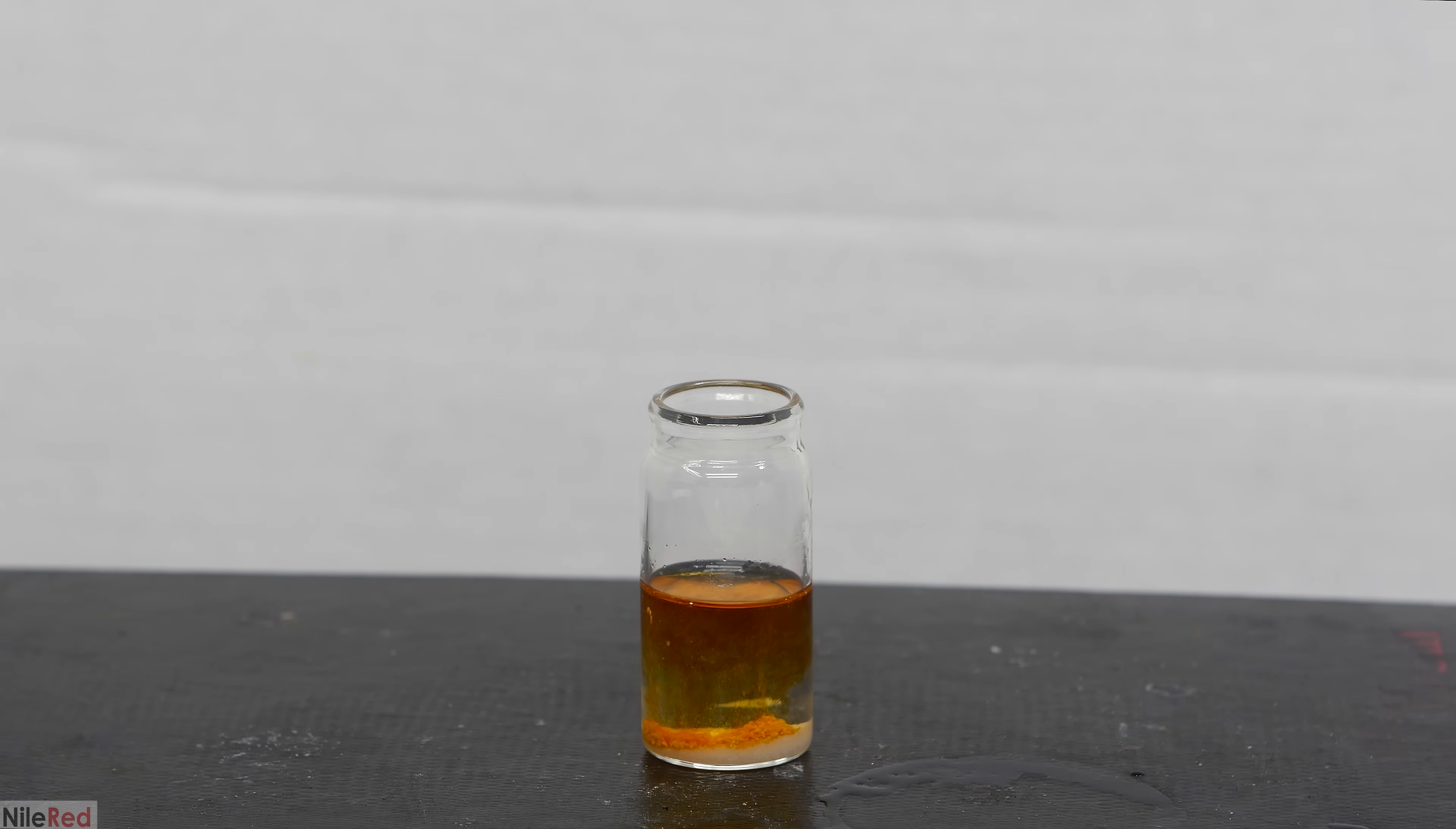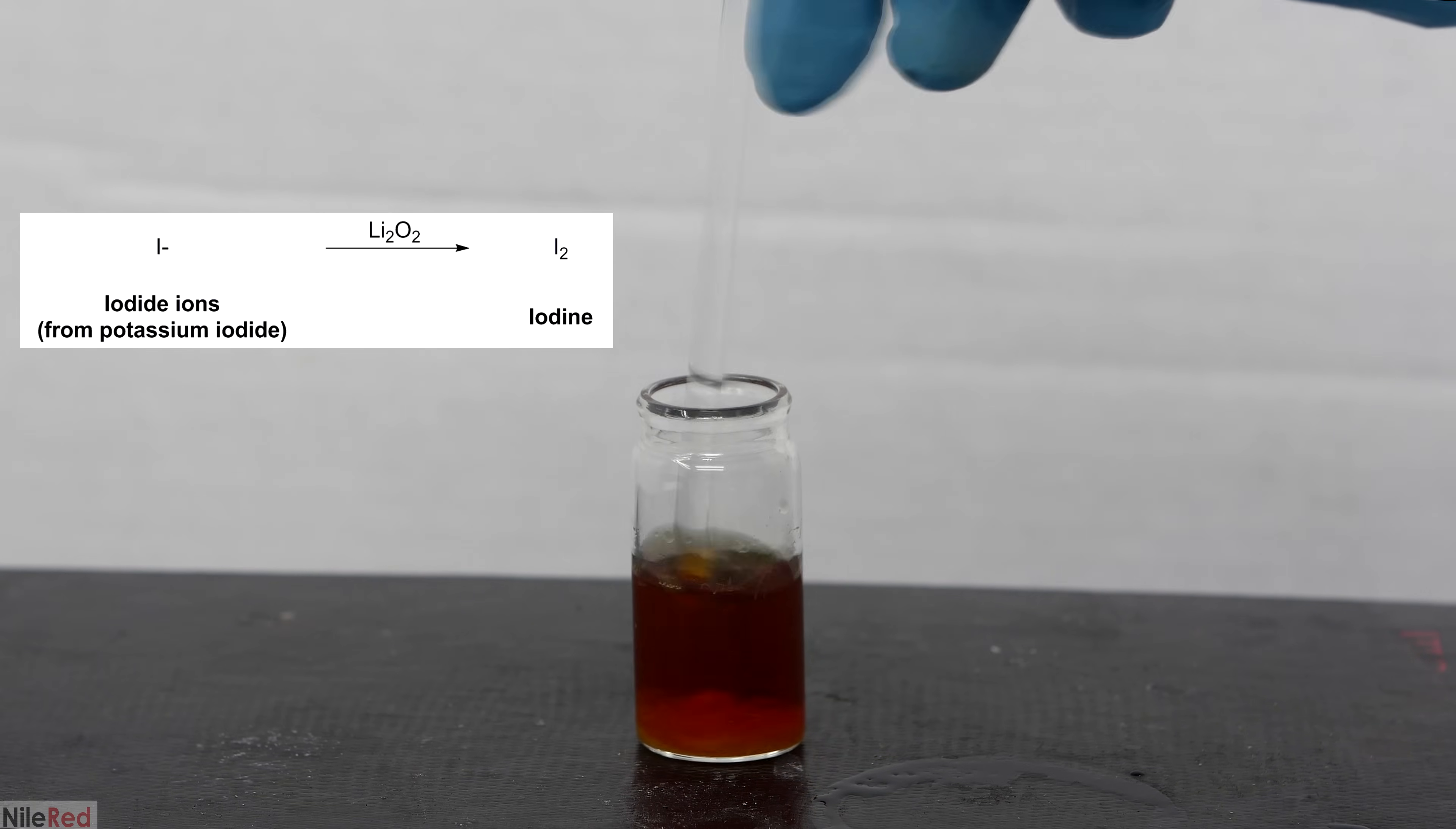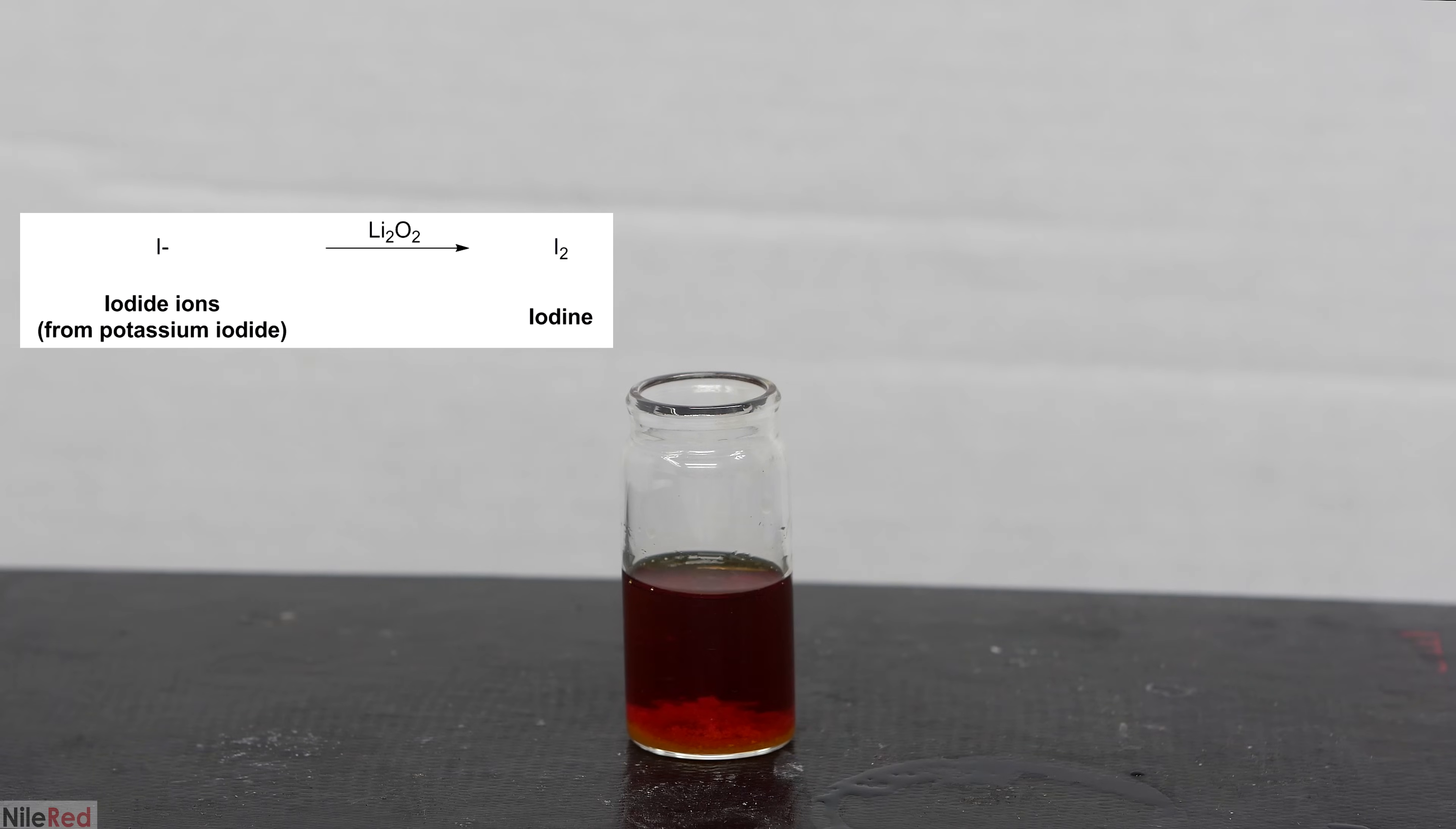When a small amount of the lithium peroxide is dumped in, you can see that immediately it starts to take on an orangey-yellow color. This color change occurs because the peroxide is a strong oxidizer, and it oxidizes the colorless I- ions to colored I2. With this positive result, we can move on and experiment a little with the lithium peroxide.